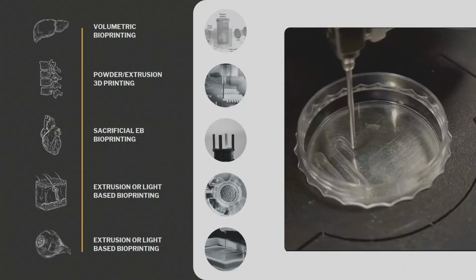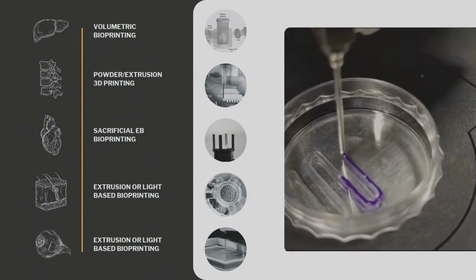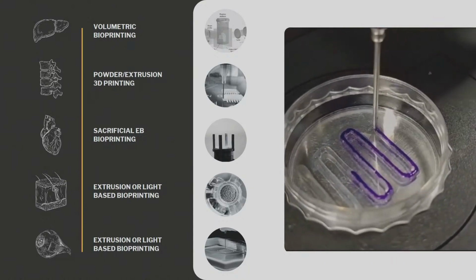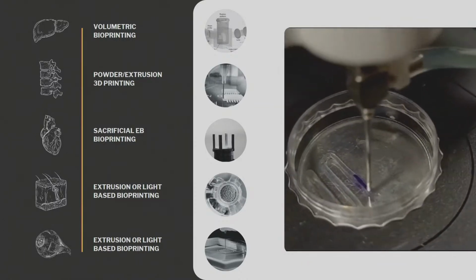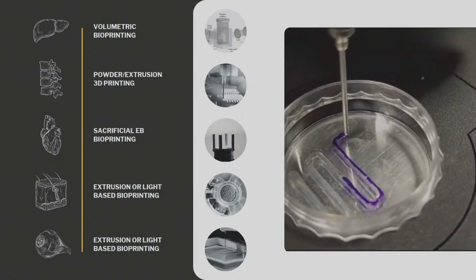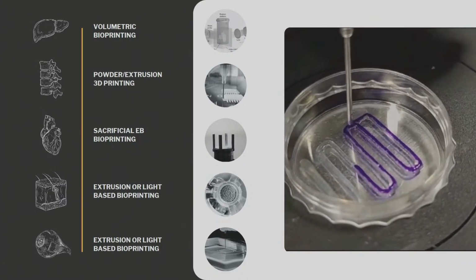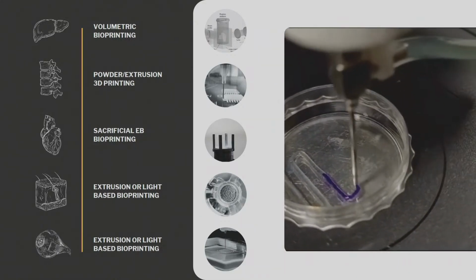Yes. So Shastra is working on esophageal cancer. That's what they told us. Wound healing is another, and we were applying for some projects, so that's how we know. They are working on esophageal applications as well, so that is another application they are focused on. They are using our bioprinters to create bone-based applications and cartilage. But apart from that, the rest of it is.